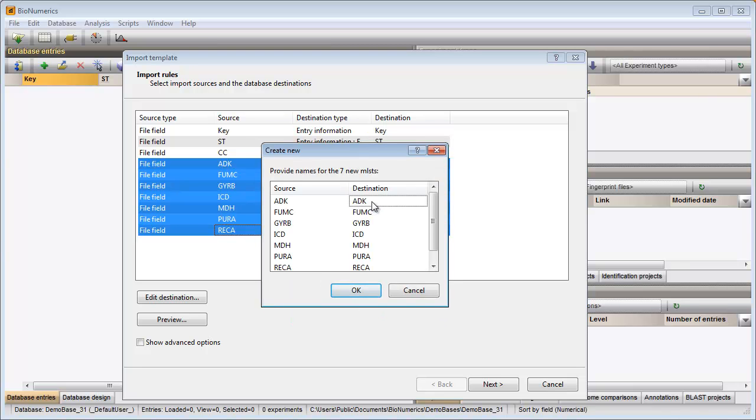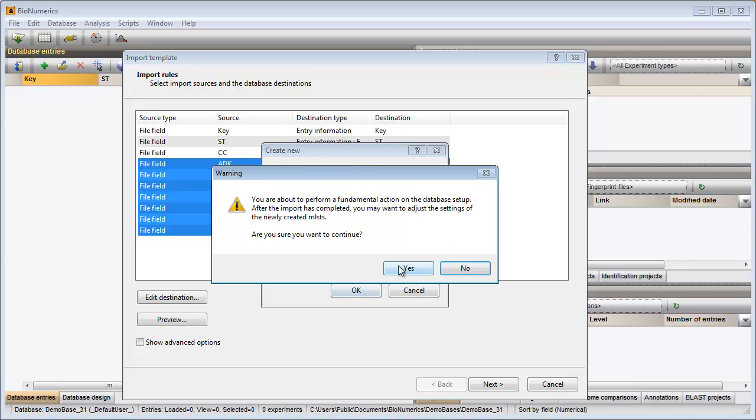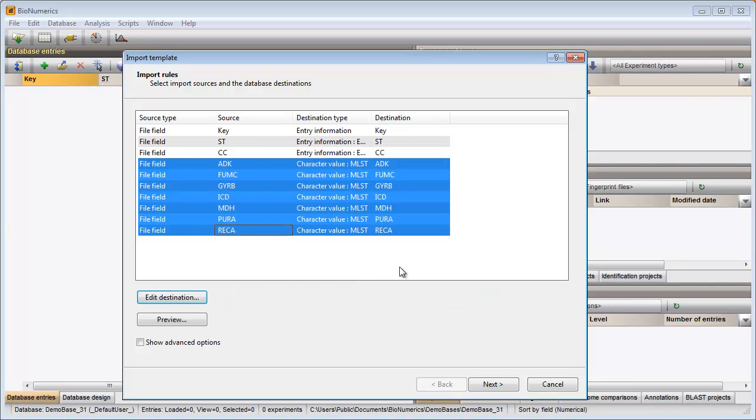I am prompted to give my characters a name. The column names that appear in my file are suggested but can be changed if desired. After confirmation the grid is updated.